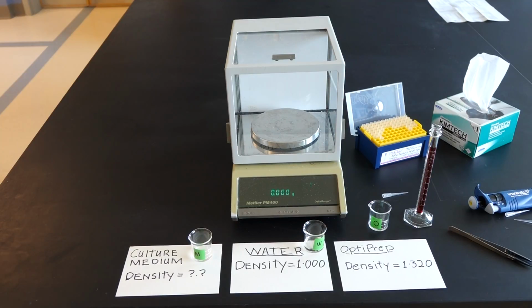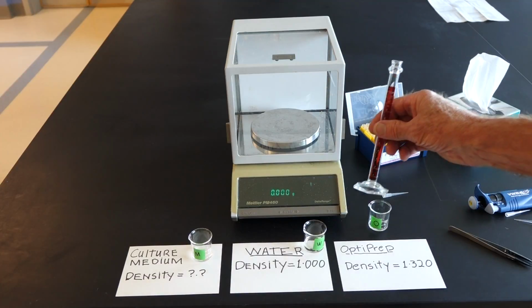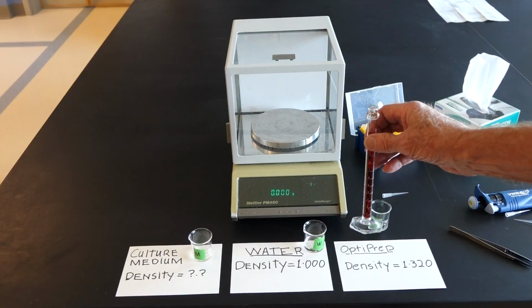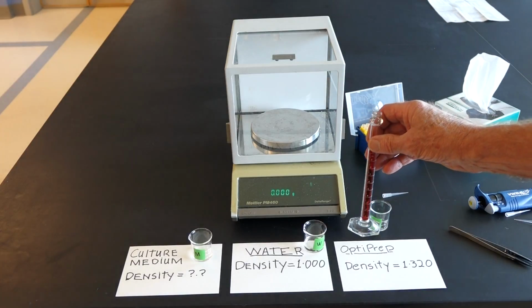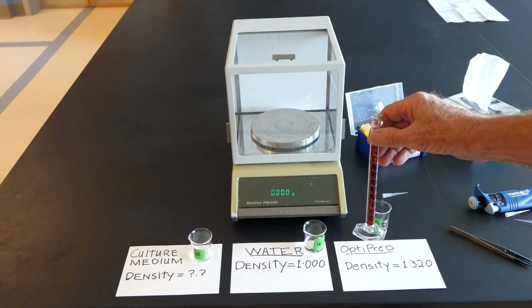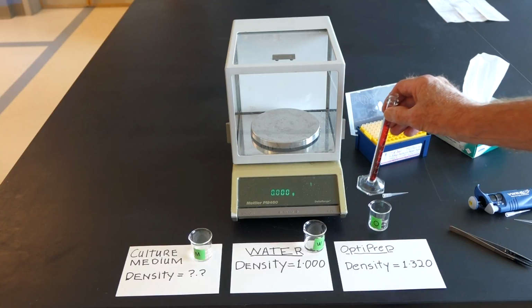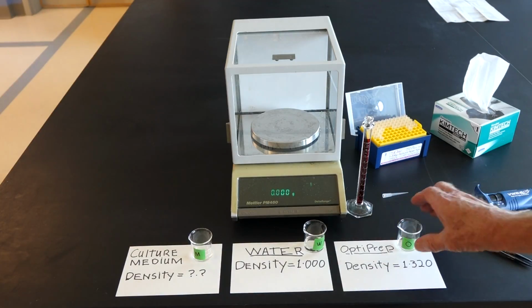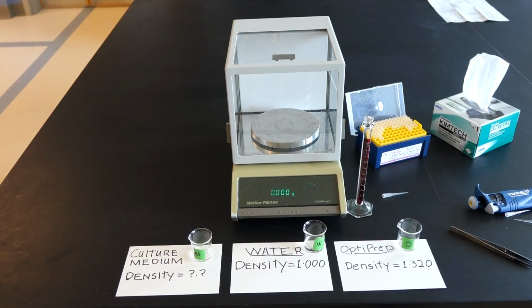You can use a graduated cylinder, having tared the cylinder to zero, then you can weigh directly a given volume of your liquid medium. That uses quite a lot of material, and it's not necessarily all that quick. So if you want to do rapid measurements, here's an easy way to measure the density of any liquid medium quite rapidly.